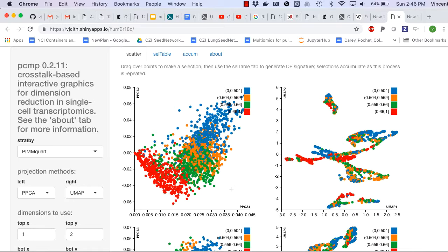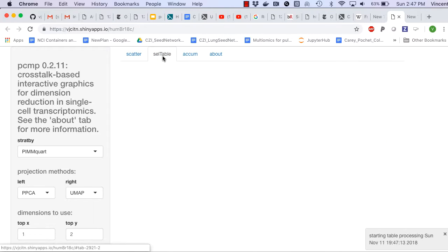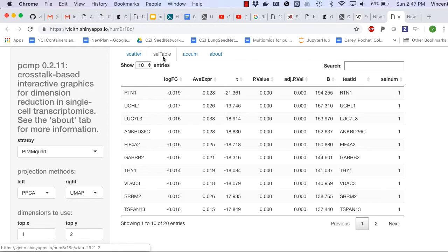And we can use the simple differential expression technique built into this visualization tool to get a feel for genes that differ in expression pattern between these relatively immature nuclei and those that have fewer reads mapping to introns.